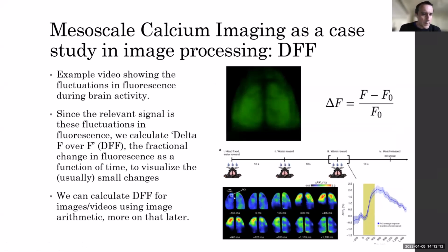So this is just kind of an example of what this typically looks like. I don't know if the video is playing. Amy, can you start it playing if it's not playing?